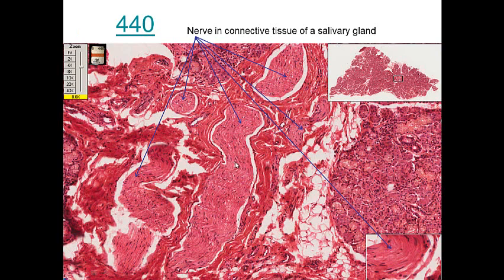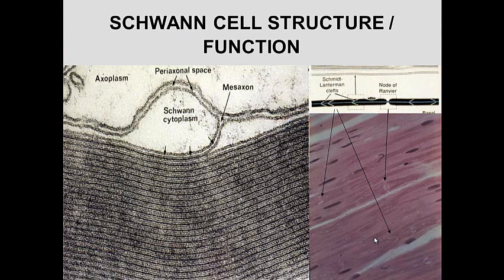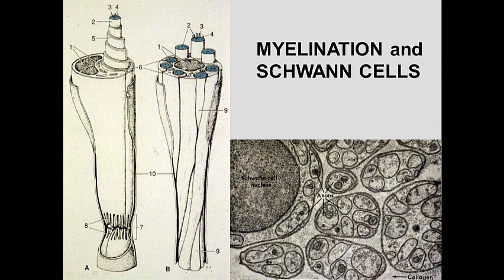Here we see in the salivary gland we can see nerves in the connective tissue. Nerves are kind of wavy, and most of what you see is the Schwann cell nuclei because the cell bodies are at a different location. Here we can see the nerve — there's a node of Ranvier, another node of Ranvier, another one right there — where one Schwann cell begins. If you have an axon that's myelinated, the Schwann cell only myelinates one axon. However, if it's non-myelinated it can accommodate more than one axon. If it's just supportive and not causing myelination, a Schwann cell can accommodate several axons.